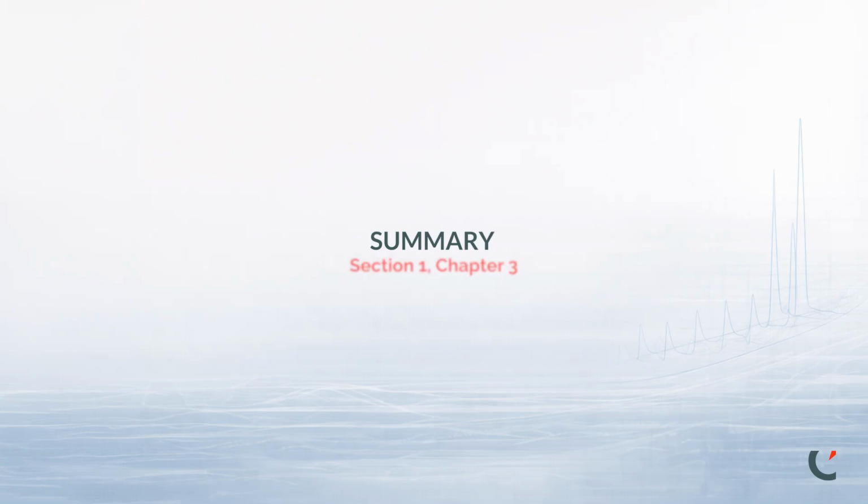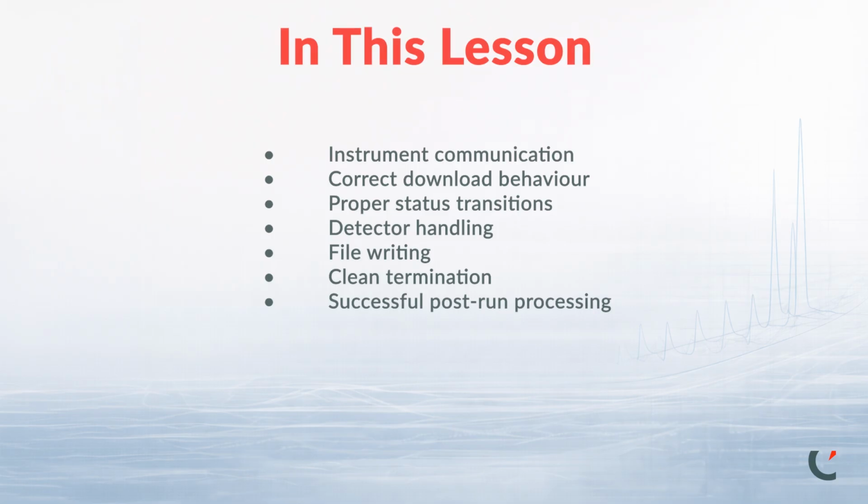Final summary, completion of Section 1, Chapter 3. In this lesson, we confirmed instrument communication, correct download behavior, proper status transitions, detector handling, file writing, clean termination, and successful post-run processing. This concludes Section 1, Understanding the System.